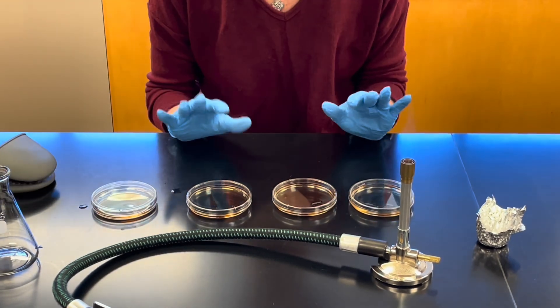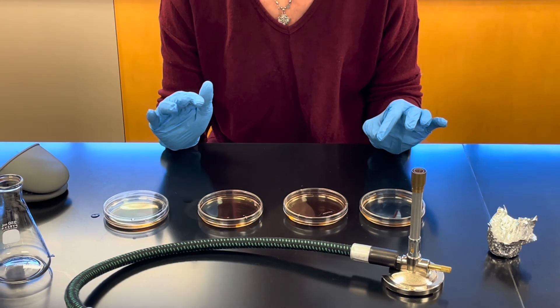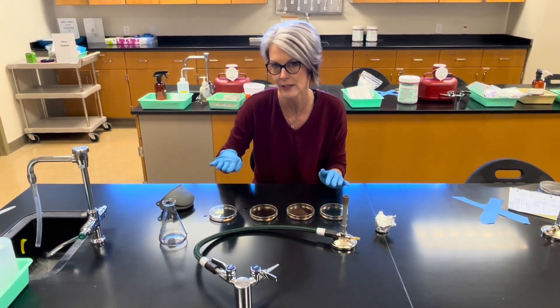We're going to leave the nutrient agar plates on the bench to solidify. Agar will solidify around 40 to 45 degrees centigrade. Once they are solid, you can invert them.